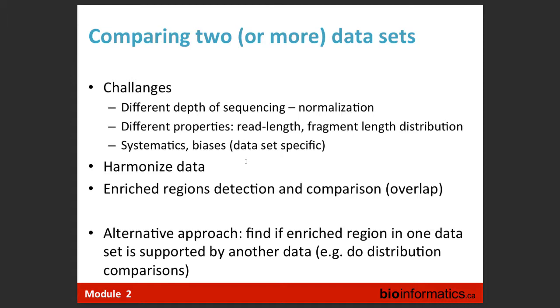It's always a question that is specific to the case. You are ranking, for example, using the p-value in MACS or in any other tool. In an ideal scenario you'll have some kind of score. Then for every peak you can look at the concordance between those scores. If you see that the majority of peaks are concordant, then of course you can question those peaks which have, say, rank 10 in one dataset and rank 30,000 in another dataset. They are very, very discordant.